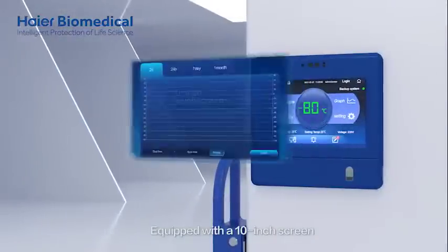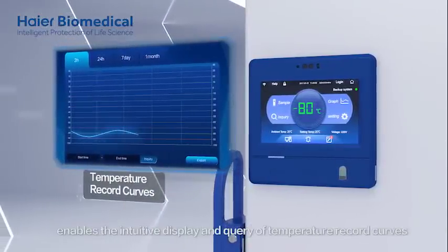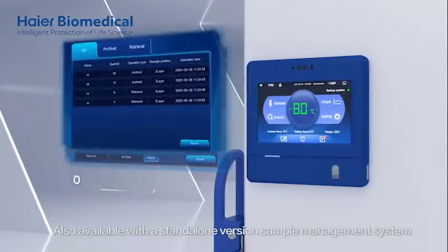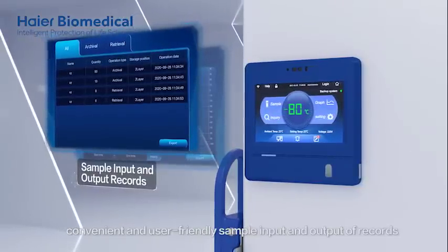Equipped with a 10-inch screen, the HIYAR Biomedical Low Energy Series Touchscreen ULT Freezer enables the intuitive display and query of temperature record curves. It is also available with a standalone version sample management system, making sample input and output records simple, convenient and user-friendly.